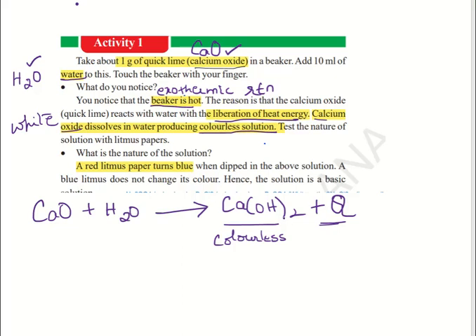Okay. What is the nature of this calcium hydroxide that is formed? That we can check with the red litmus paper. When you take a red litmus paper and dip it in the solution, the red litmus paper will turn blue. Blue indicates that it is basic, and OH also is telling us: whenever there is OH in the formula, it is a direct indicator that it is a basic solution. Underline here, the solution is basic. Okay. Now let us check whether the formula is balanced or not.